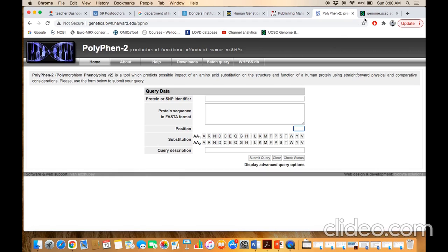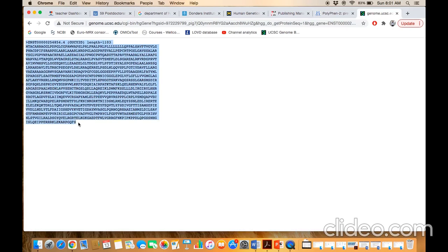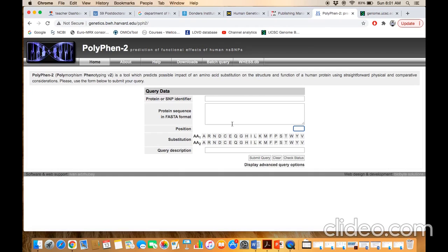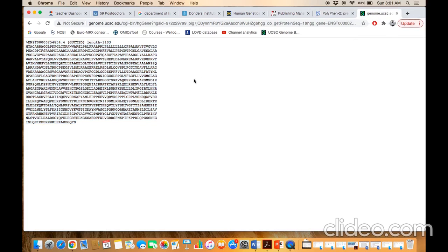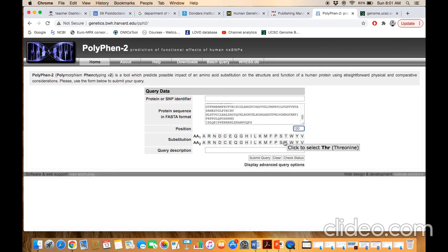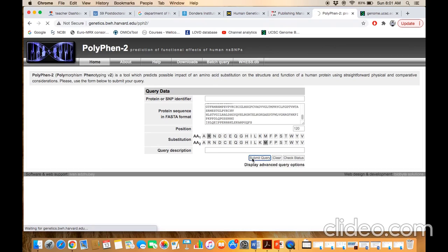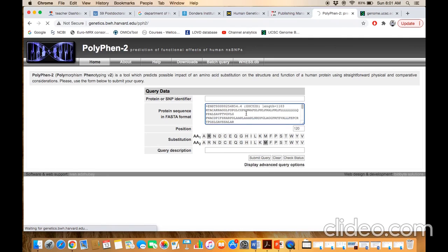For example, if we have this sequence — this sequence belongs to the GUCY2D protein — copy this sequence and paste it here in the query box. For example, say position 120. You should know that at position 120, arginine amino acid is present in the wild type protein. Just click on arginine and it will be selected. Now, for example, say we have data for the GUCY2D protein where we found a change of arginine at position 120 with methionine. Click on the mutant amino acid and then click the submit button. Make sure that in the query box you paste only the wild type sequence — the normal sequence.